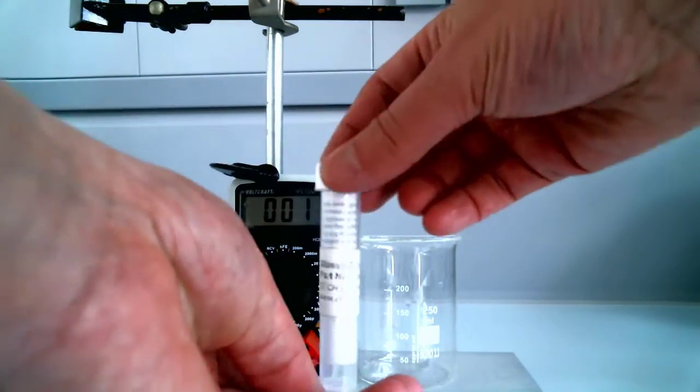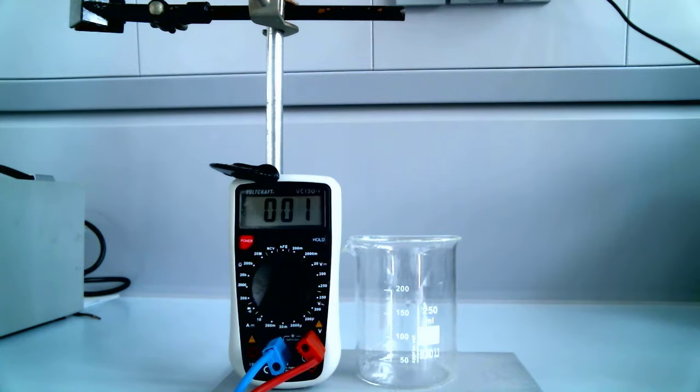Okay, welcome to Applied Materials and Corrosion. We want to measure the voltage at a carbon electrode here.